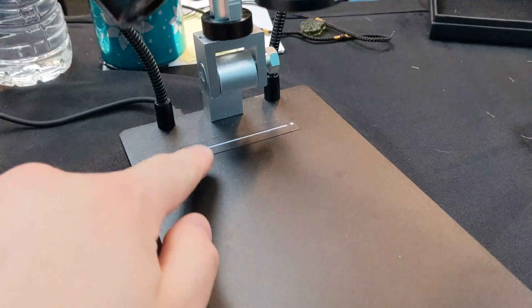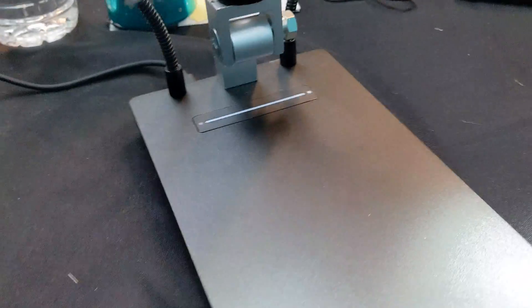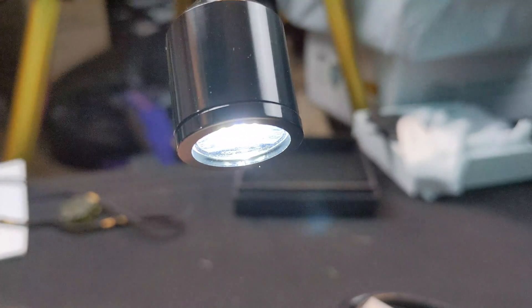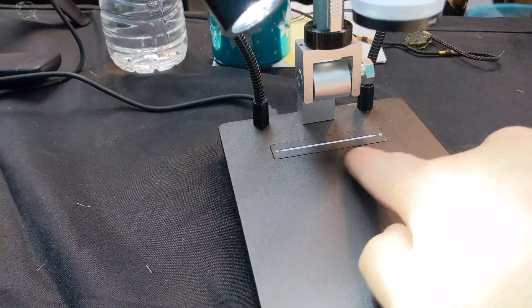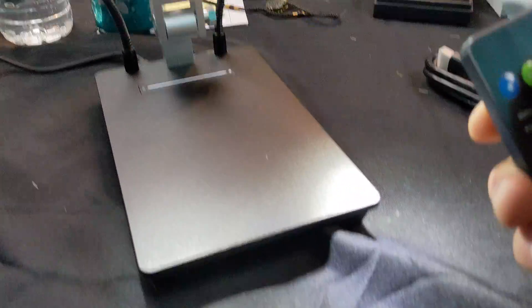The lights are touch-sensitive. Touching the top gives you maximum brightness, touching the bottom dims them — you can adjust just by tapping. It also comes with a remote control that helps you zoom in and zoom out.